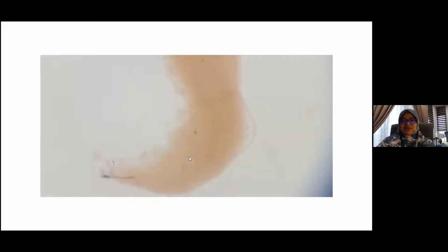Usually if I identify that, I will make some 1 millimeter sections, identifying the regions of interest, because the tissue will be processed in 1 millimeter sections each. So it's very, very tiny.